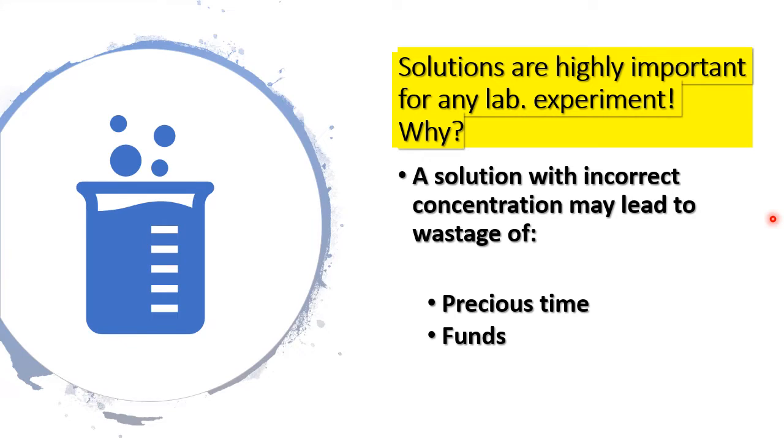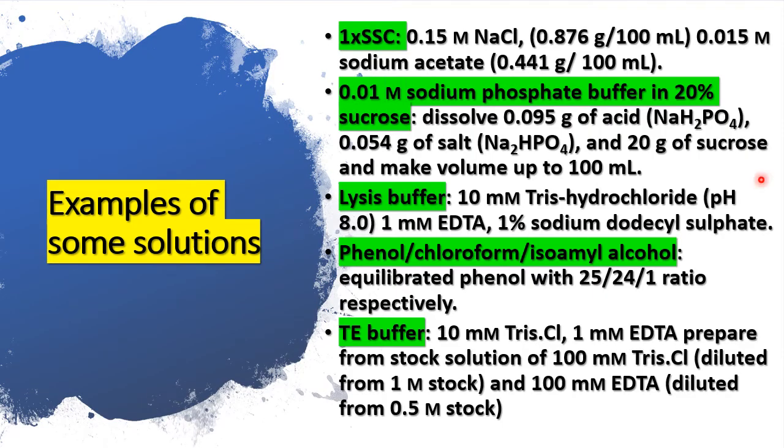So, I will go through the different types of solutions, and how you can prepare those for your experiments. Here are examples of some solutions that are used in different labs, and of course the types and number of solutions is in thousands, not in hundreds. But here I give you the basic theme of how to prepare those solutions. Some solutions are very simple, other ones are complicated, but the basic theme is the same.